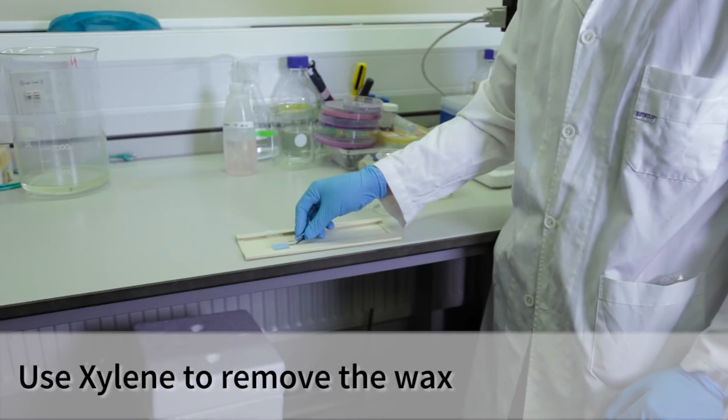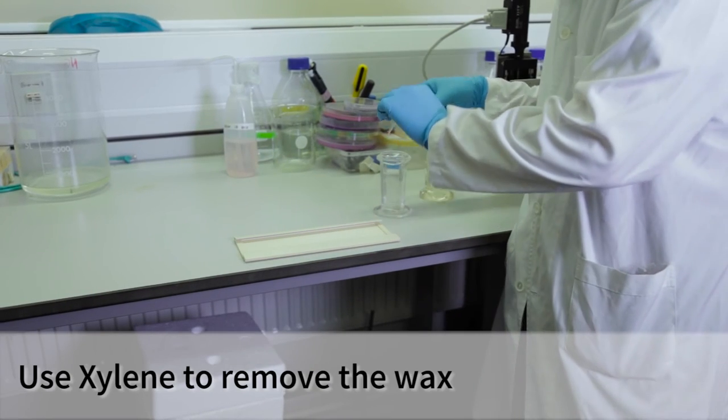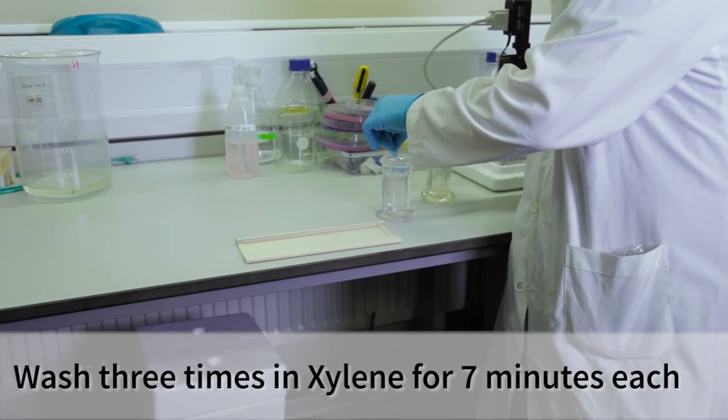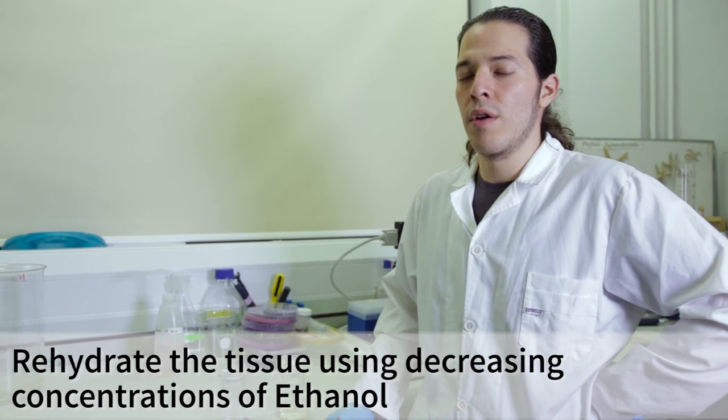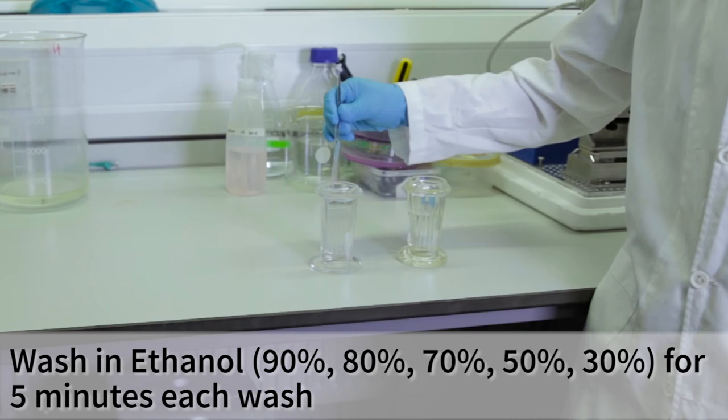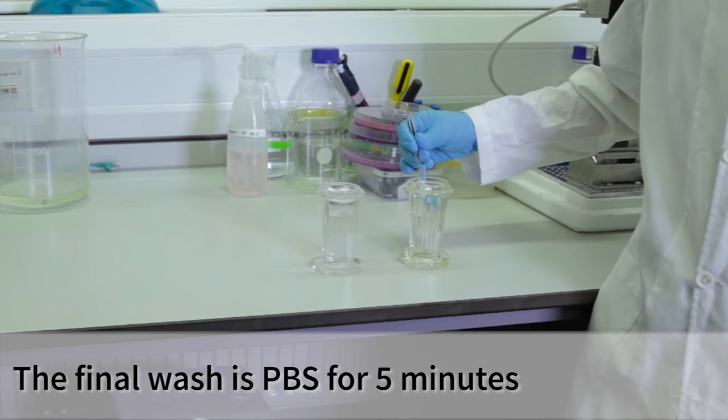We need to remove the wax that helped us to section the tissue. For this, we will use xylene. Now, we need to rehydrate the tissue. For this, we will use decreasing concentrations of ethanol. The tissue is rehydrated.